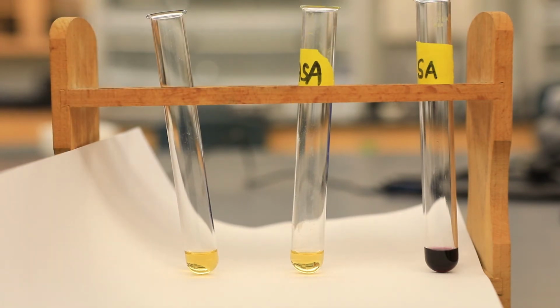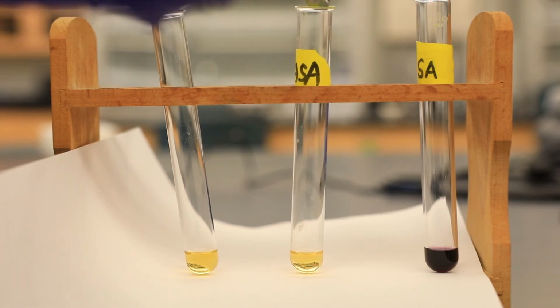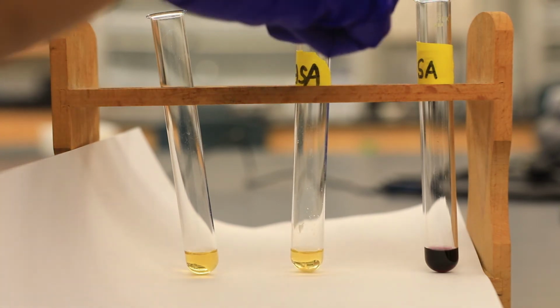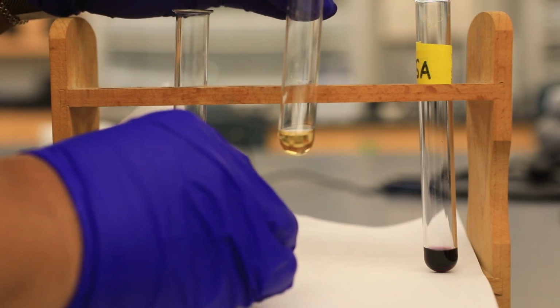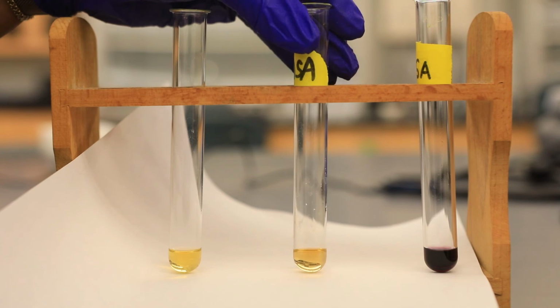So I'm going to add just a crystal or 2, not too much is required, of our sample of aspirin, and let's see how pure our sample is. And I'm hoping that, yes, it's going to be colored, but hopefully it will be much lighter than just pure salicylic acid. So I'm going to take a minute and mix that around. So I'll certainly say that you can see the formation of a colored complex, but our sample is more or less fairly pure.